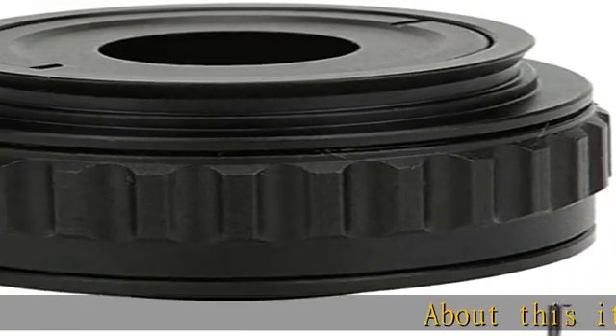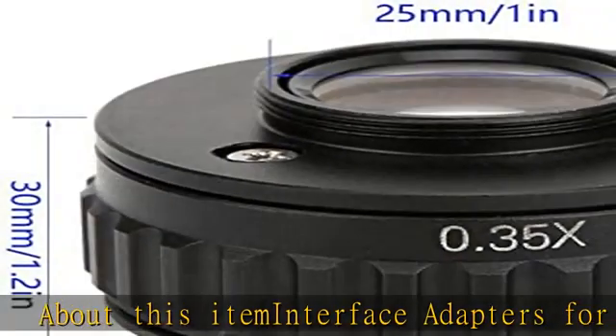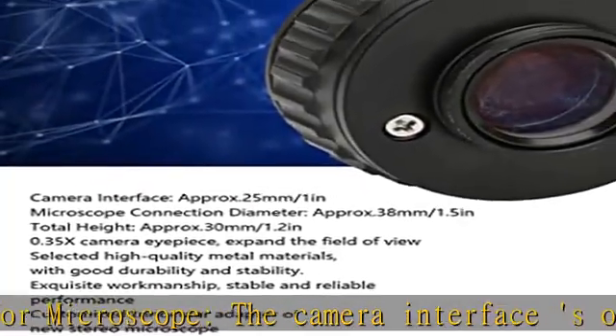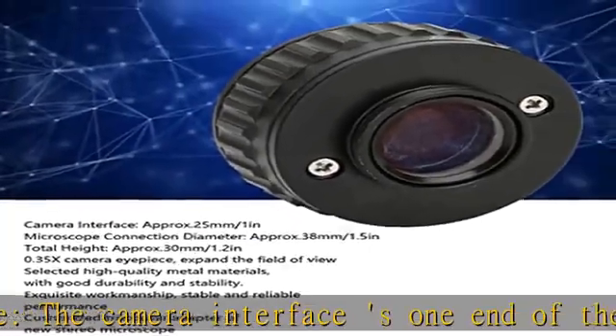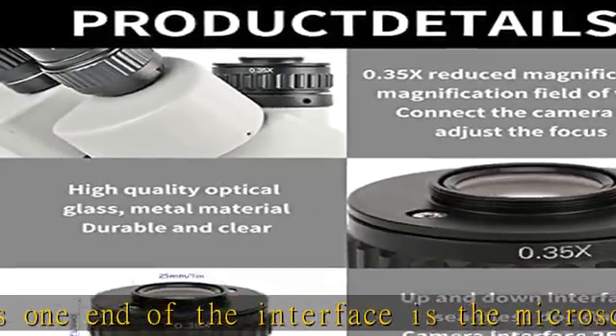About this item: interface adapters for microscope. The camera interface — one end is the microscope interface thread, and on the other end is the C interface. High efficiency 0.35x camera eyepiece, expands the field of view, making observation more effective with longer service life.